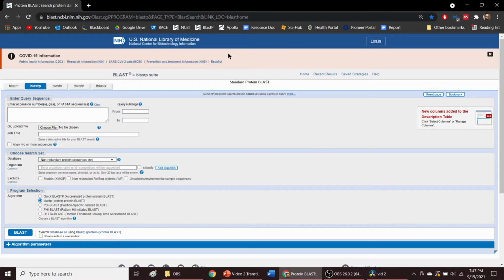So what is BLAST? This stands for Basic Local Alignment Search Tool. BLAST finds regions of similarity between nucleotide or protein sequences to other sequences in the NCBI database. It then calculates the statistical significance, generates alignments, and allows us to examine differences in the domains. By comparing sequences in this way, we can determine the function of a sequence if it is unknown, or determine how well a sequence with a known function compares to its orthologs.